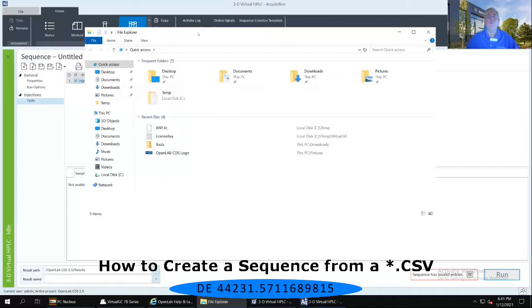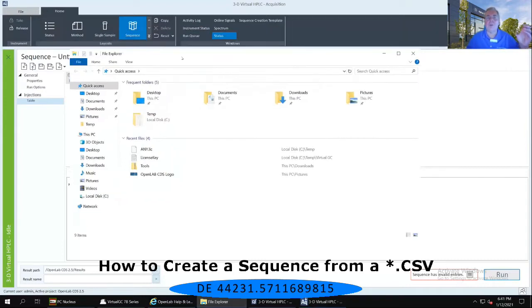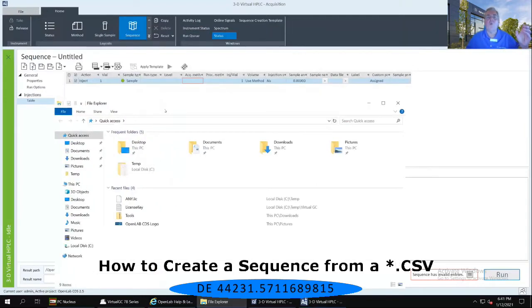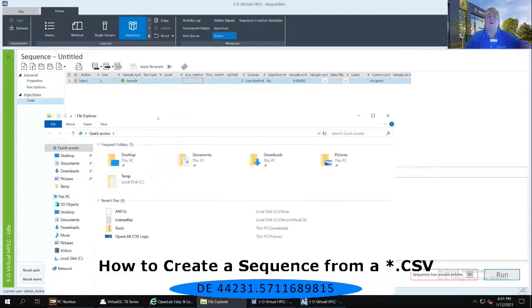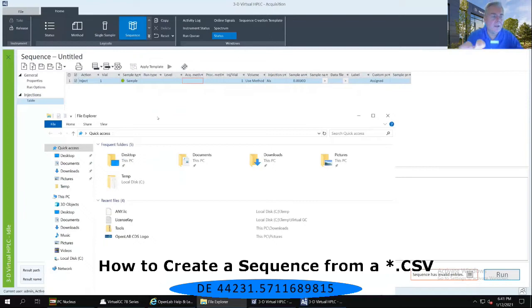I then want you to take that Windows File Explorer window and drag it just a little bit below where the sequence table is in the window behind it.